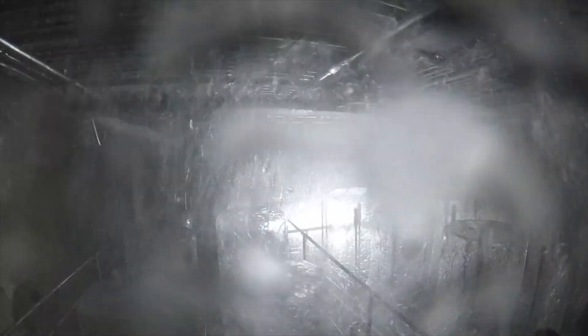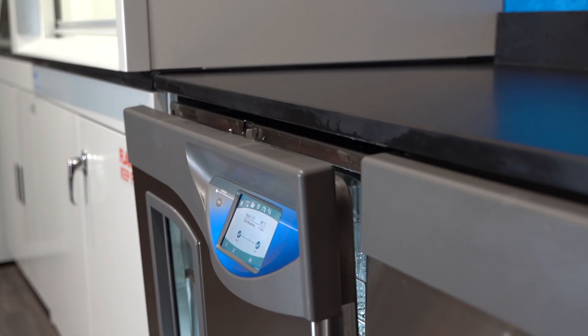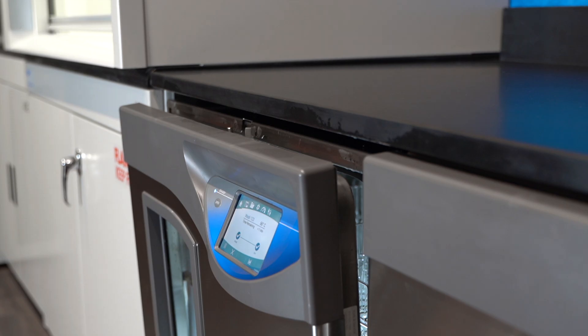Speedvent technology, which is user selectable, automatically opens the door when the internal temperature reaches 50 degrees to speed drying.